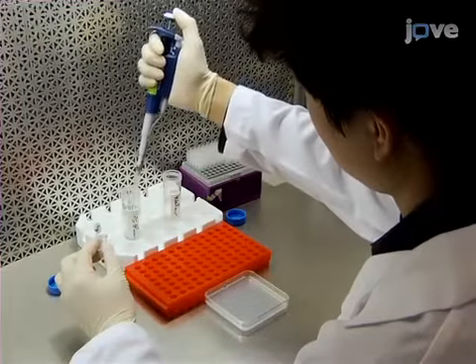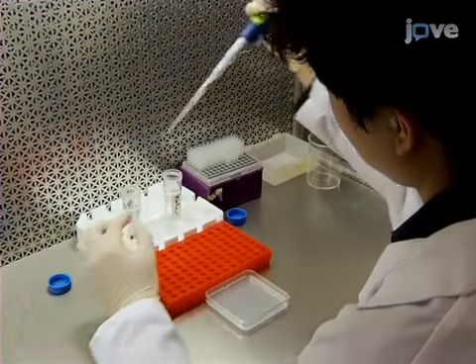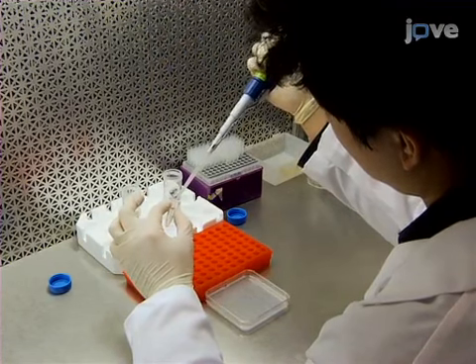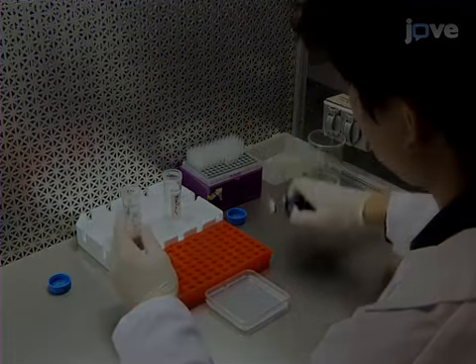To begin this procedure, sterilize the seeds of Arabidopsis plants expressing Aequorin with 10% bleach solution, containing 0.01% Triton X-100.